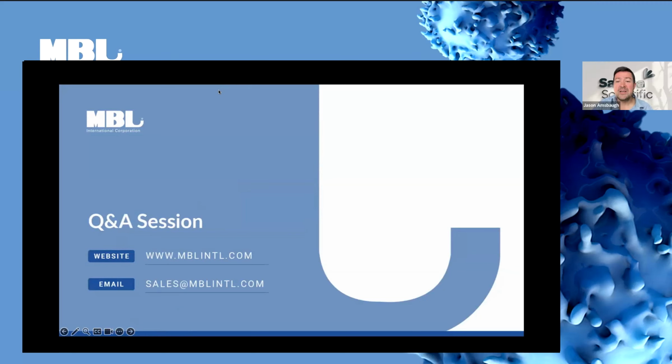Okay, terrific. The next question is, does peptide concentration affect MHC peptide binding affinity? And is it a good idea to use higher concentration for lower binding peptides? Yes, it does. Like I showed you, in most cases it doesn't matter. You can have a whole range, but yes, there are some difficult peptides that don't like to bind, and for those we would recommend using a higher concentration.